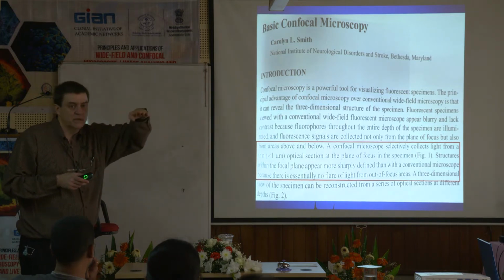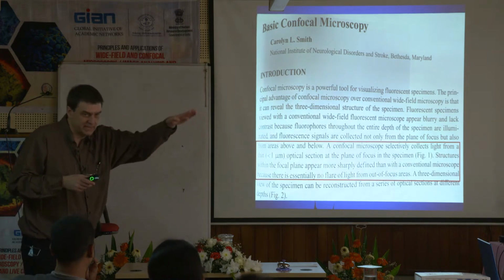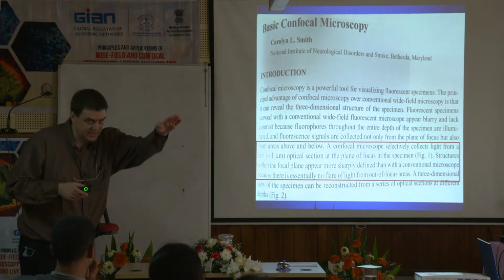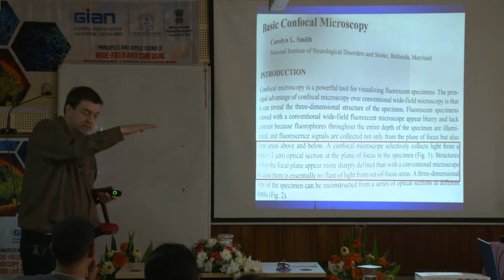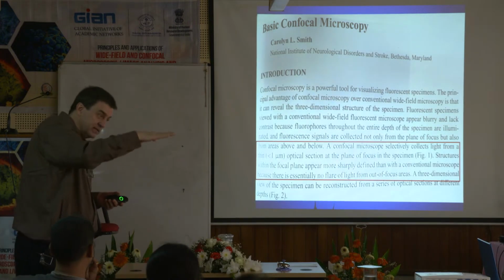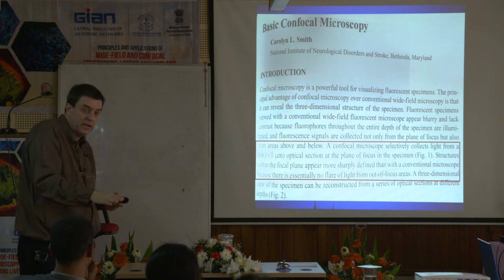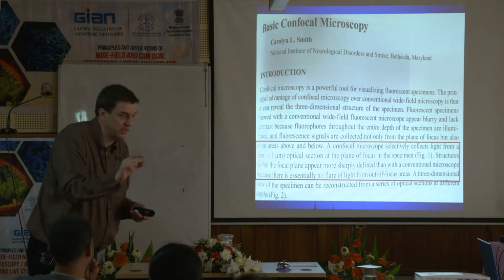or you have the microtome to cut a very thin section, and you take that section, put it on a slide. Take the next section, put it on a slide. Take that next section, put it on a slide, right? And that way you can look through the tissue physically. You could literally cut it and look at each piece, and that way you could go into the tissue and look at it that way. But here, instead of cutting it, we're going to use light to do our cutting for us.